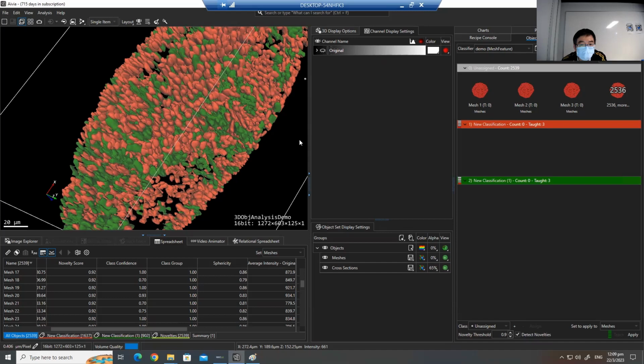Which one? Regression also. You may regression. Can you elaborate on regression?